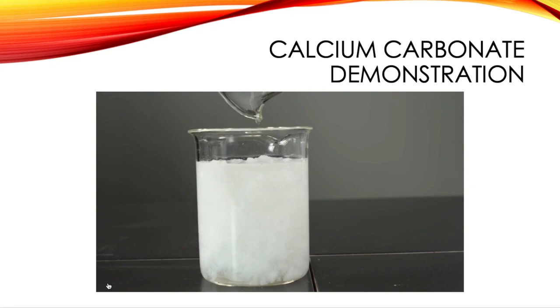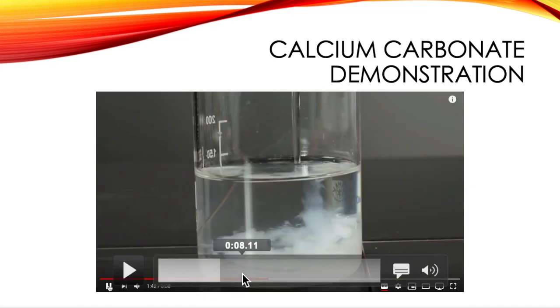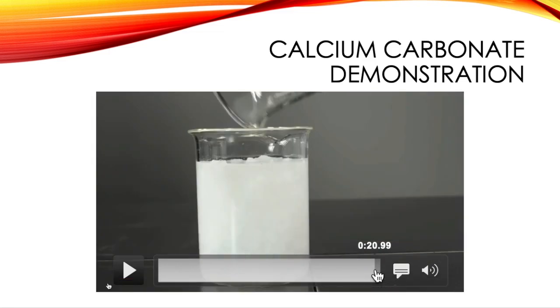And when they're starting to mix, there's this foggy appearance. It has the appearance of a fog. You can see that right there, and it's instant. But then at the end of the video, at the end of the reaction, you can see how there are chunks, like right here. That is the calcium carbonate.